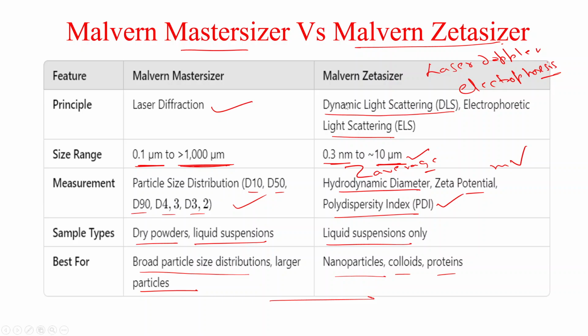So depending on your sample, depending on the size of the particles expected in the sample, we are deciding which technique to go for.